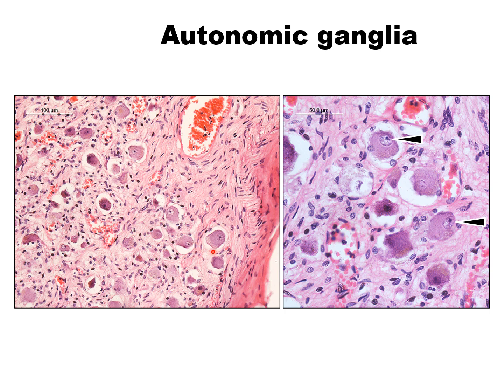So identifying features of the autonomic ganglia are the irregular cells, the position of the nucleus is eccentric, the Nissl granules are there, finer Nissl granules, and the satellite cells. See, the satellite cells are less in number in comparison to the sensory ganglia. Now, see the nerve fibers.